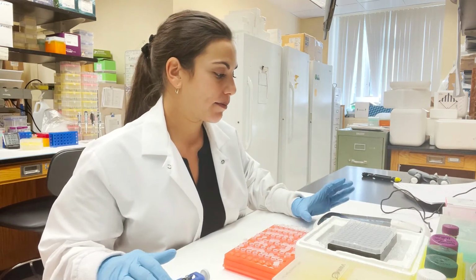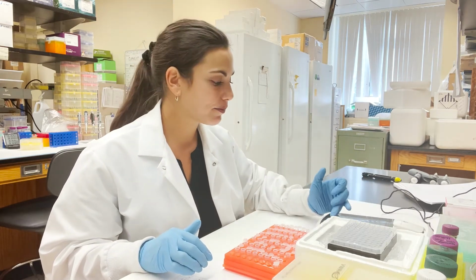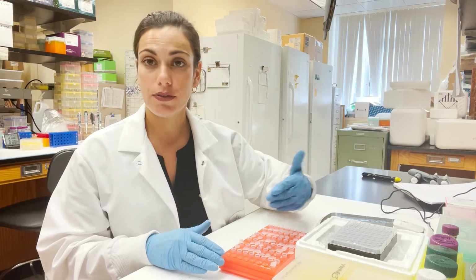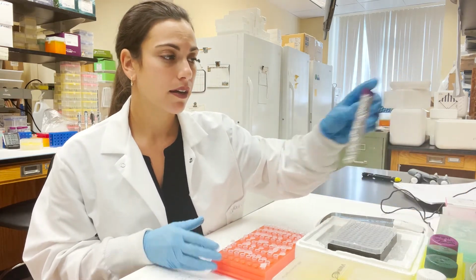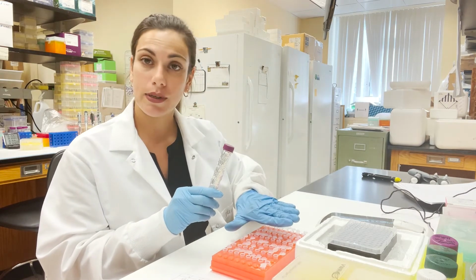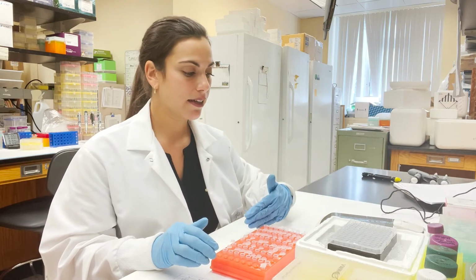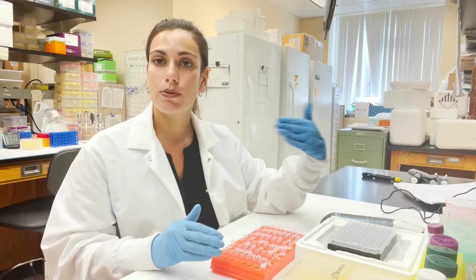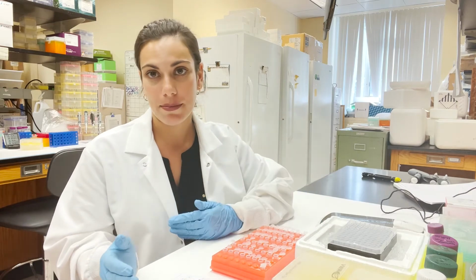So now I'm ready to run my samples. I put that I'm adding 4 microliters of DNA. And what I like to do is I like to work in rows of 2, just because of the way the timing is. So I'm going to pipette the working solution into every row, 2 at a time. And then I'll add 4 microliters of the DNA, vortex it, and then I'll read it because I know about 2 minutes has passed. And then I'll do the same for the next row. Your working time might be a little bit different.